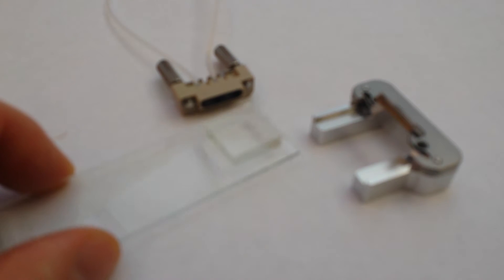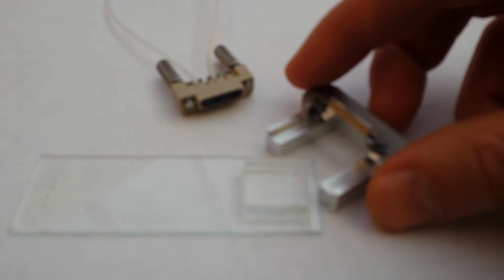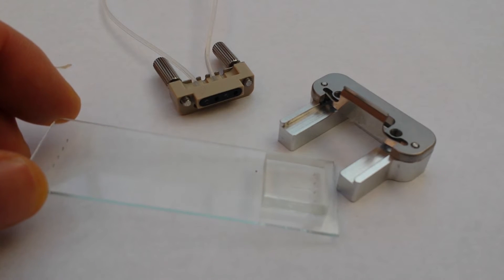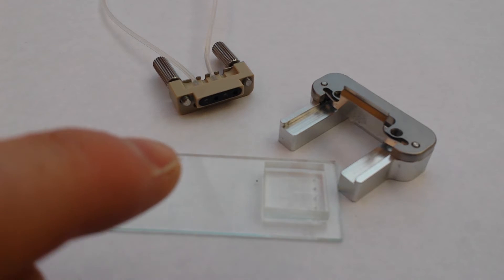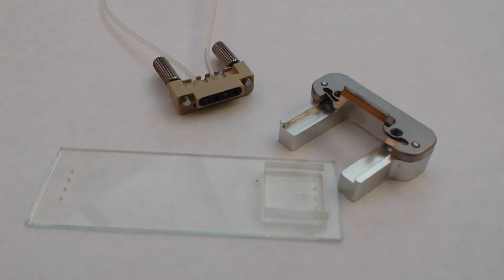So let me talk you through this system a little bit. We have four holes on this side and four holes on this side. You can design your PDMS chip to be quite large — this slide is 75mm by 25mm — so you could design a device to span from here all the way to here. If you want inputs on one side and outputs on another side, you can span the entire glass device.